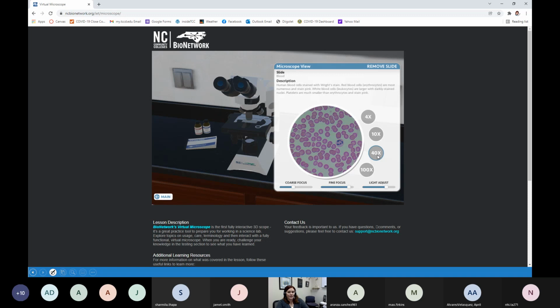What do we think? Microscopes look easy, look hard. Can't wait to touch one, right? Oh, I got the crickets again. Y'all are killing me, man. Nice. Jamel gave me the easy button. Love it. Perfect. Yeah, Angelita, we will be in person next week, so we're going to touch these microscopes. I think with practice, it is going to be easy for us. I think we'll be able to figure it out.